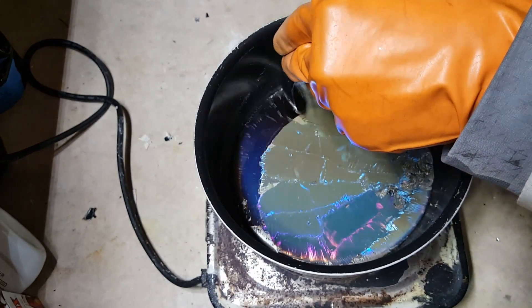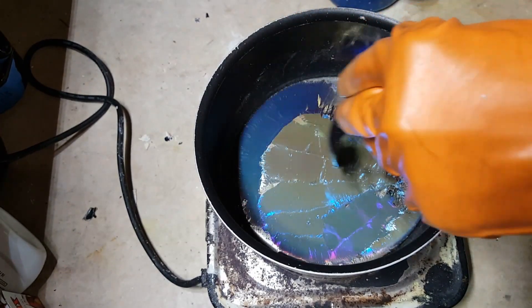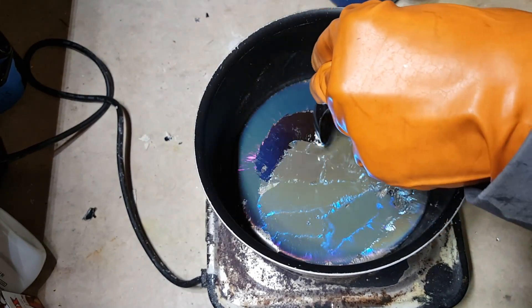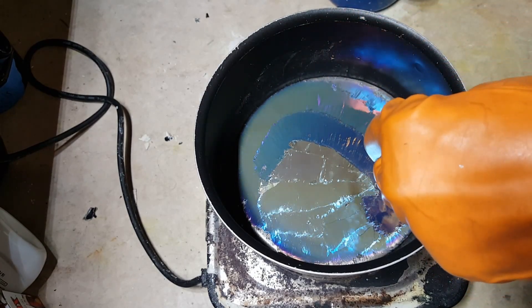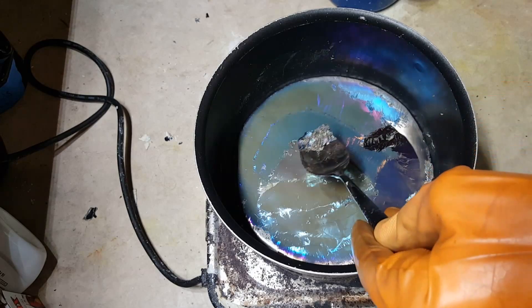It'll quickly coat itself in an oxide layer again, but that's okay. It's unrealistic to remove every last bit of it, but remove as much as you can. The more pure your bismuth, the better the crystals are going to be.